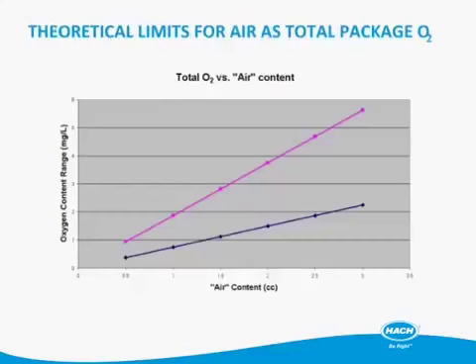You've got the 80-20 ratio and the 60-40. So if we look at the bubble and we say we have a quantity of air and it all came from the headspace, so we had a package where we packaged perfectly and got bubbles of air out of just the headspace, they would follow the blue line. They would show you what's in the headspace.